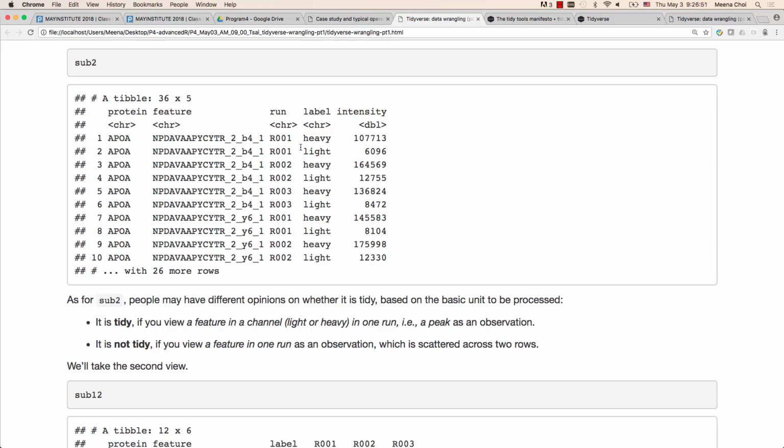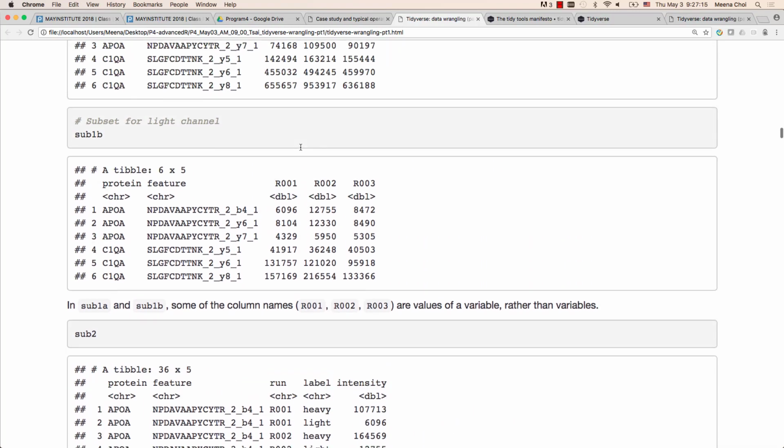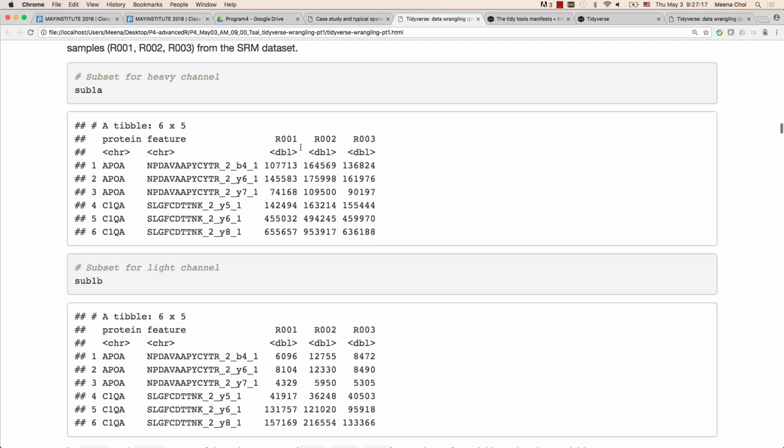Yes? And you have here a DIA dataset, and you will not find all transitions or all fragment ions over all runs. So would you then list for all runs the fragments again and give NA values, or would you just leave them free? Or you could also make columns for every fragment, basically, and then write values. Yeah, so the representation that you talk about is, say, for example, you have a protein, you have the feature here, and you want to store the intensity in every run here, and so you may have some NA here, etc.